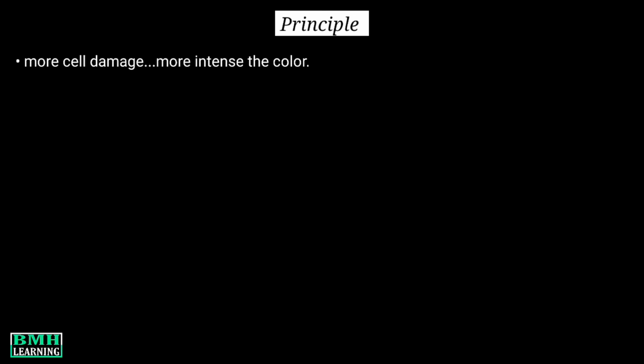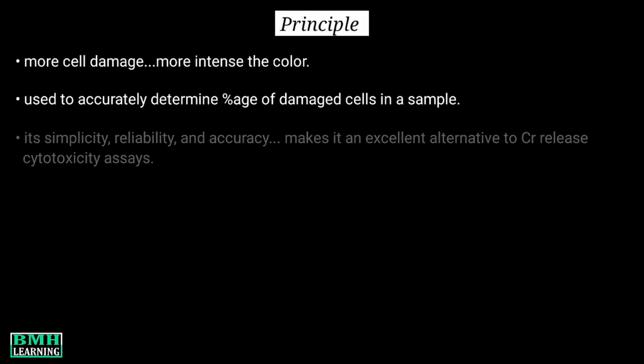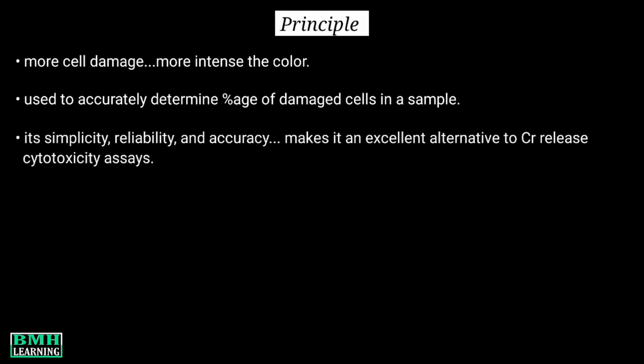Due to the inherent linearity of the LDH cytotoxicity assay, it can be easily used to accurately determine the percentage of damaged, or we can say injured cells in a sample. Moreover, its simplicity, reliability, and accuracy make it an excellent alternative to chromium release cytotoxicity assays, which is a highly sensitive method that measures low levels of cytotoxicity by using radioactive isotopes.